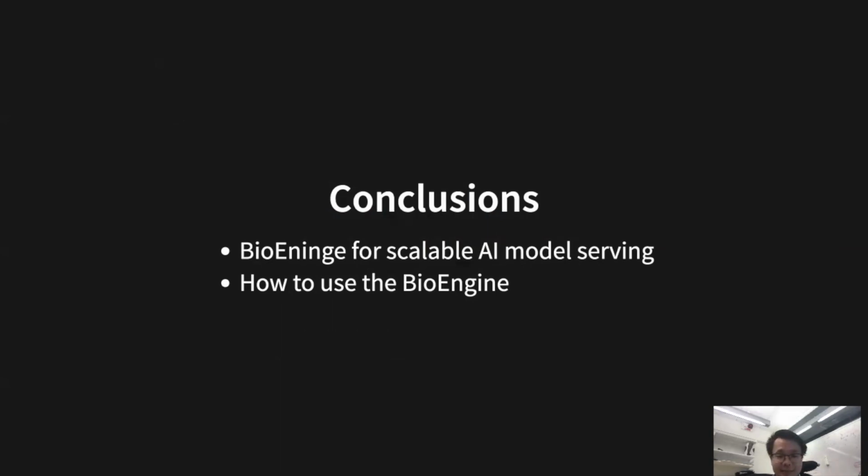Just as a disclaimer, because this BioEngine server is still in an experimental state, it might sometimes be down for upgrade or maintenance. So just be aware that if you don't get it to run at the moment, try again later. We will try to make it available as much as we can.